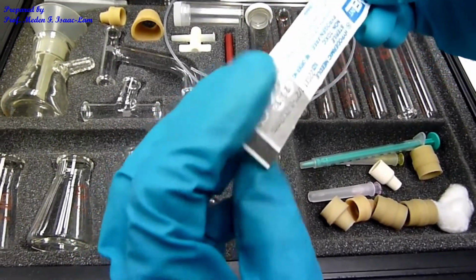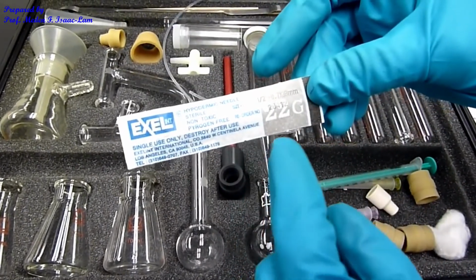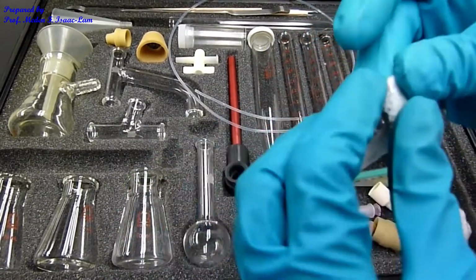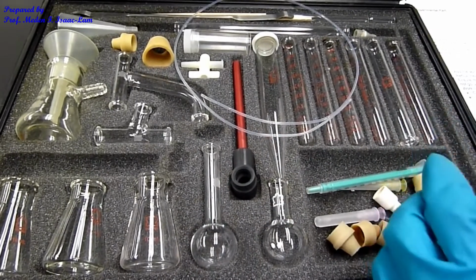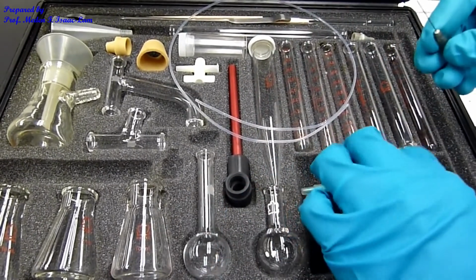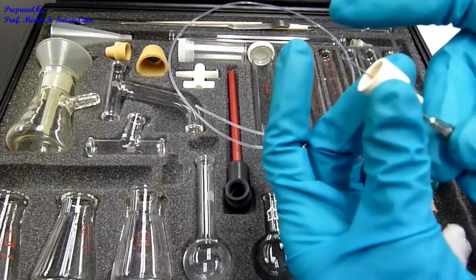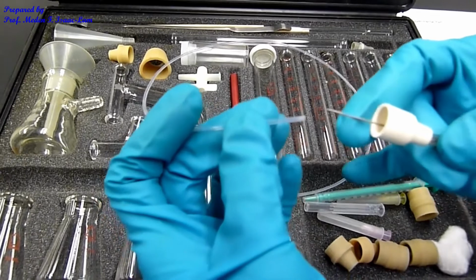So I will take a 22 gauge needle, and then I'm going to get a septum here, and I will attach the needle. Just be careful. And then I will attach it to the Teflon tubing.